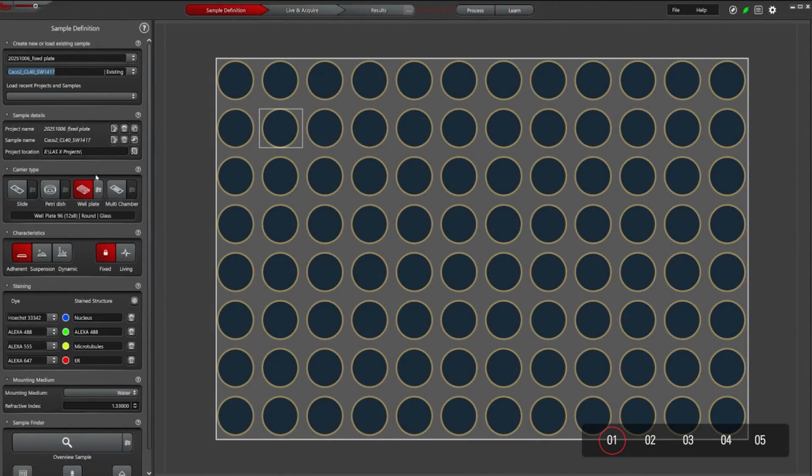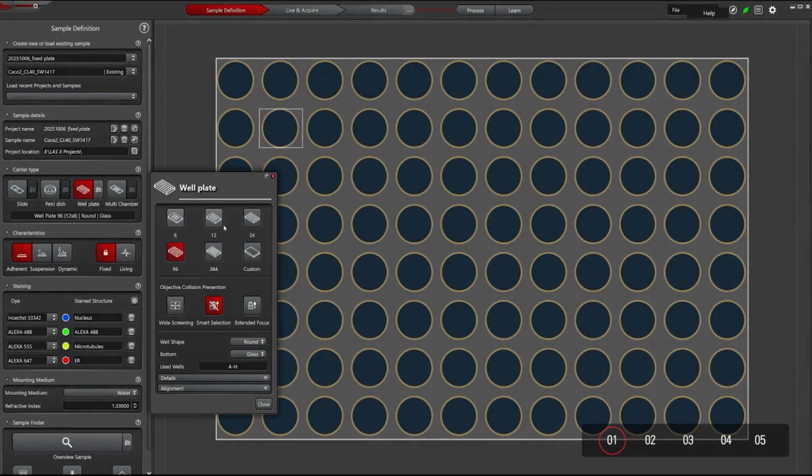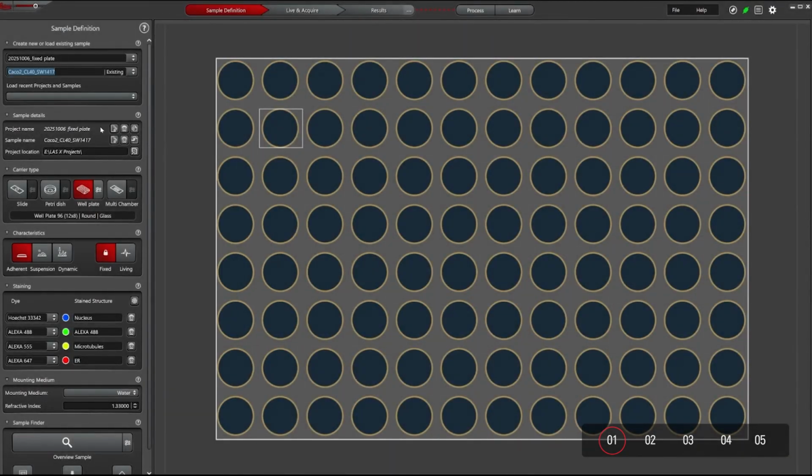There are two different ways you can call up LAS X online help. 1. Open the help menu at the right top corner. 2. Click the white question mark or red eye symbol located at the top right corner of every dialog field.